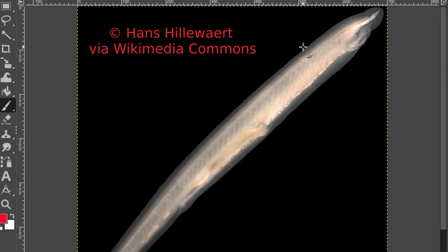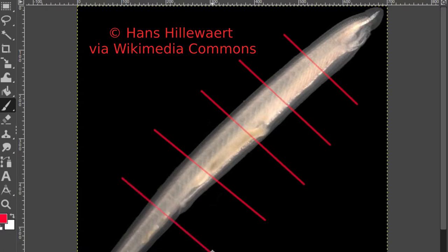So the slide that we're going to look at is transverse sections, which means that we have a section perhaps here, and then another one here, and then they're taking serial sections all the way down. So we'll miss out on the structures of the head, but we'll get a good nice look at the organs and how they flow through the body of the lancelet.